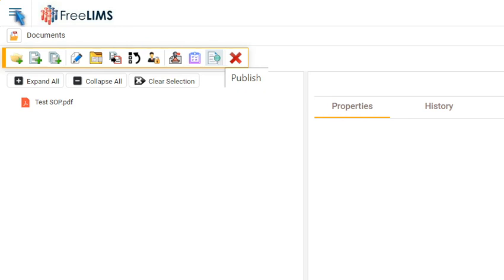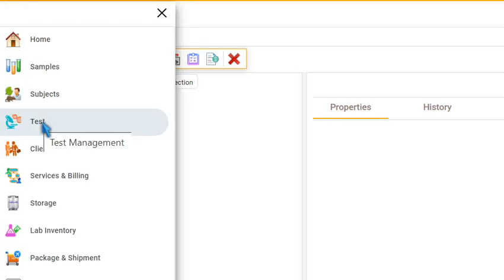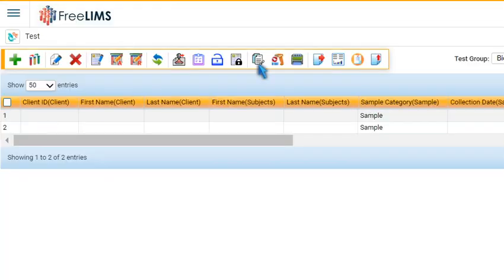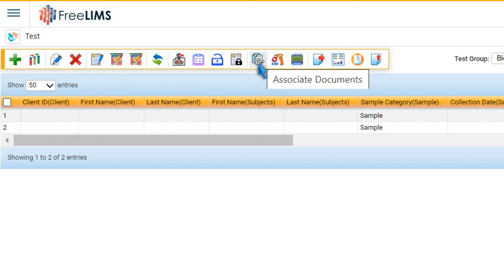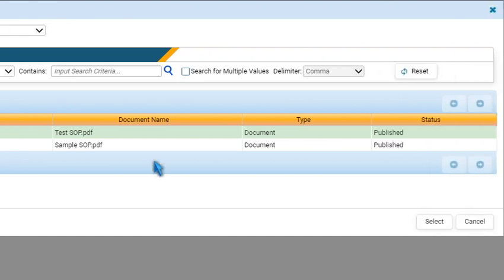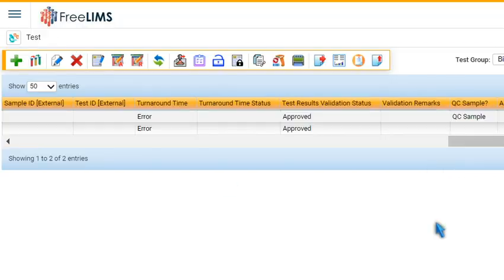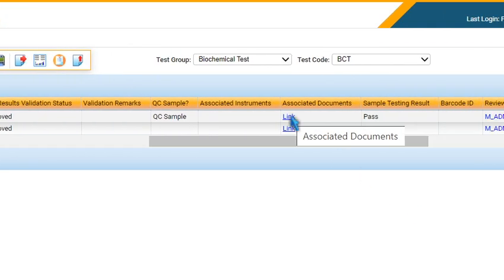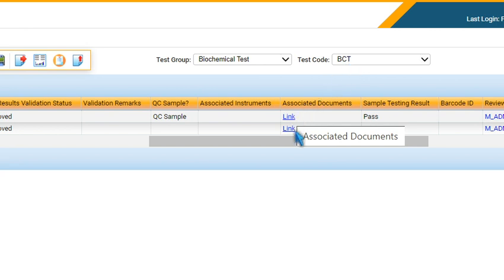Now, navigate to the Test Management module and click the Associate Document icon. Select the required document from the list of available documents and press Select. The selected document gets associated with all the test records present under the selected Test Group and Test Code, and is visible both in the Tabular view as well as in the Form view.